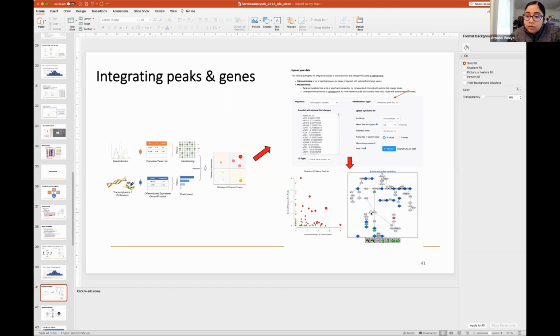Okay, great, thank you. There's a question here. When processing data in MetaboAnalyst, is it possible to take into consideration batch effect and apply a correction? If so, what algorithm would you consider using? Or maybe you already have something in MetaboAnalyst that can be used for batch effects in general?